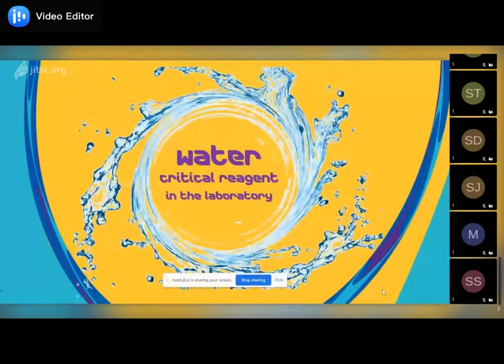But we forget one very critical factor. If we do not consider water as a critical reagent, definitely this may create a lot of problems in our experiment. So going forward, my request to all of you, please consider water as a critical reagent.